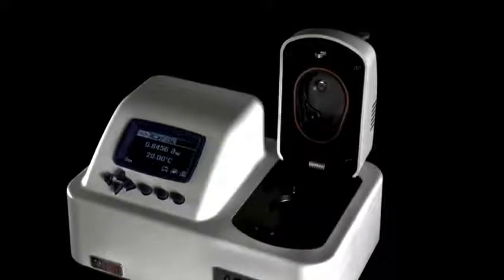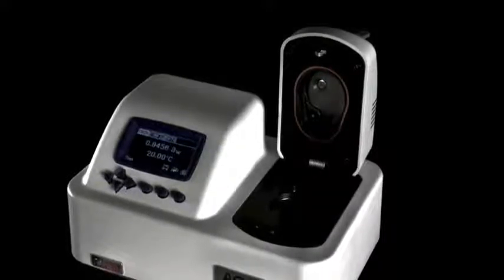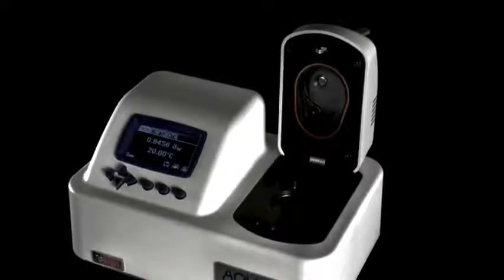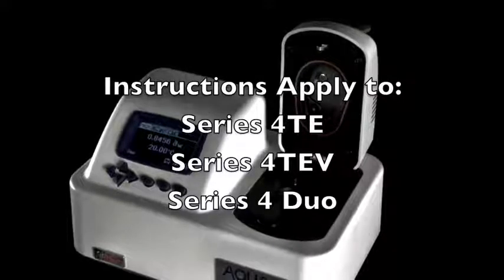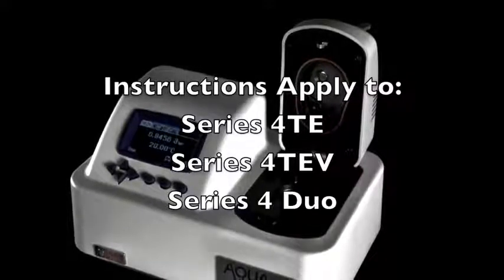What's more, the new Series 4's clamshell design makes cleaning easier than ever. Today's video features a Series 4 TEV, but these instructions also apply to the Series 4 Duo and the Series 4 TE.